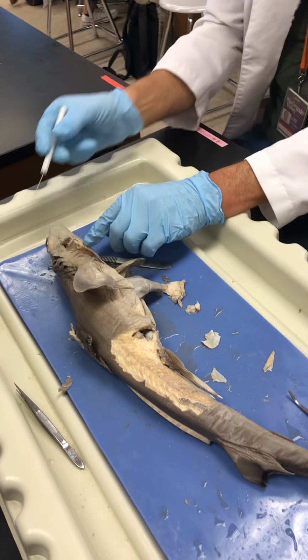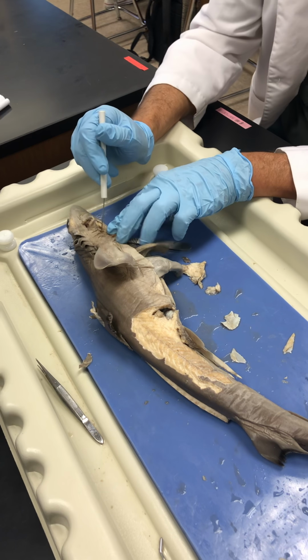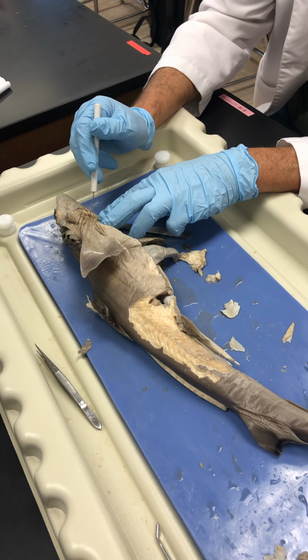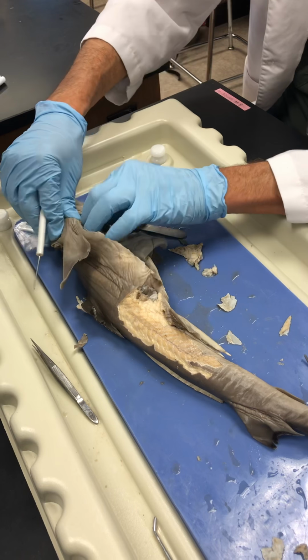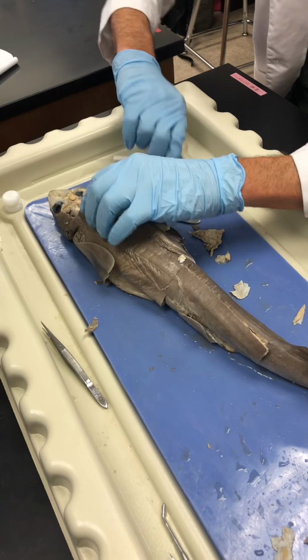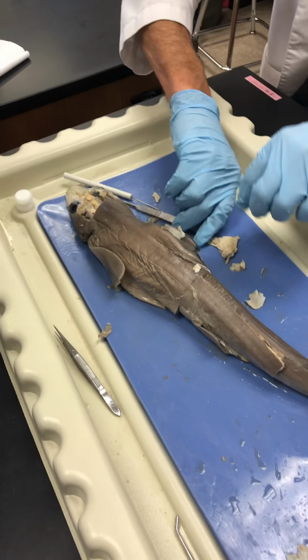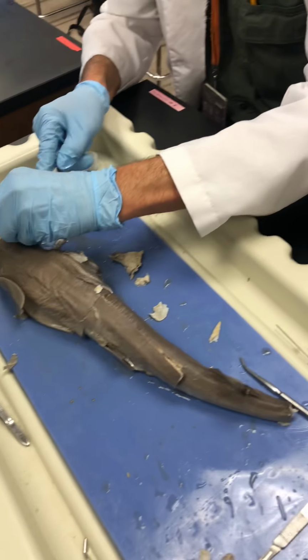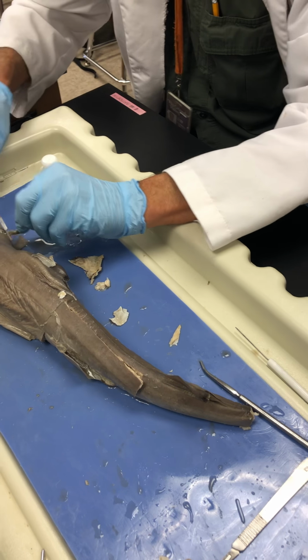Okay. Somewhere before you get to the heart, the pharynx changes into the esophagus, and then it goes into the stomach. Okay. Now, did y'all cut open the gill? Yeah, here we go. I love a sharp knife. Just call me Jack the Ripper.